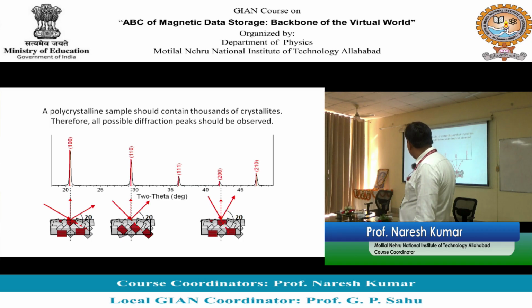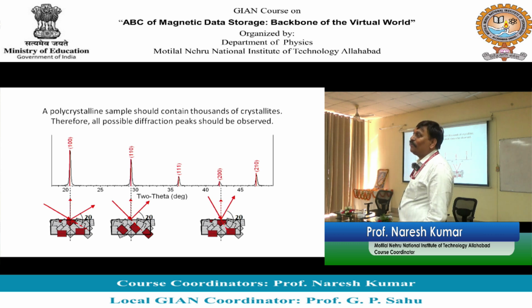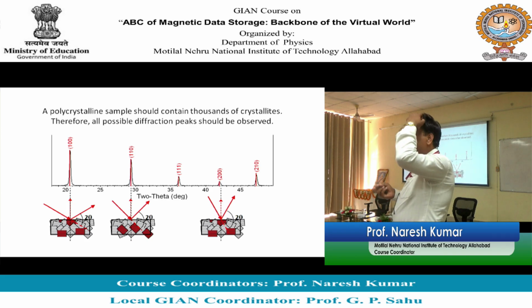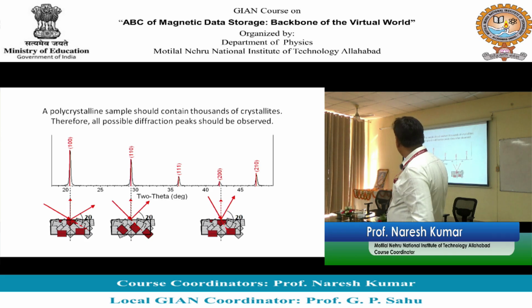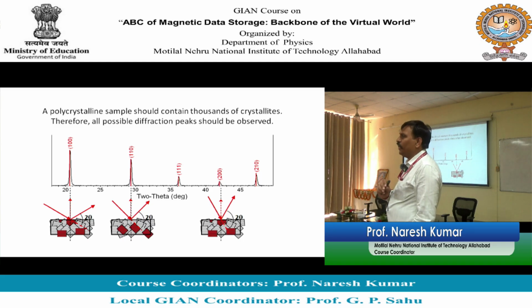एक और चीज़ है, width of this peak, broadening of the peak. So if peak is getting broadened, that means my X-ray is getting diffracted from the smaller particles. So it will tell you information about particle size. इसमें debate है, although कुछ papers कहते हैं कि particle size is calculated from this peak width, but absolutely बहुत मुश्किल है ना. Qualitative analysis you can do.